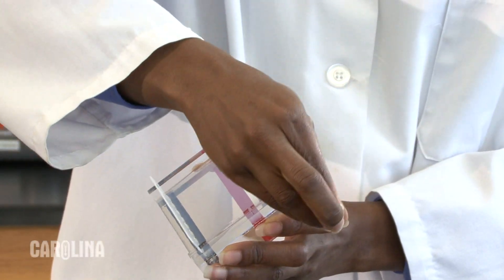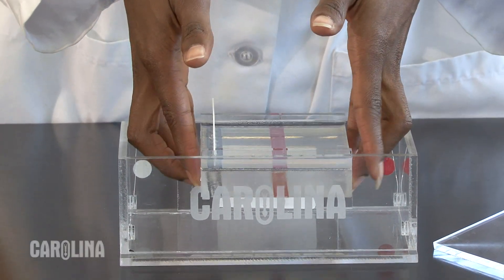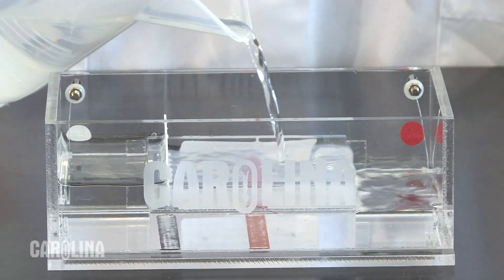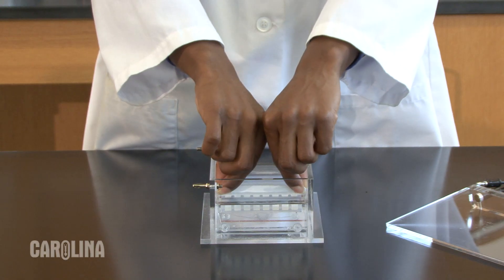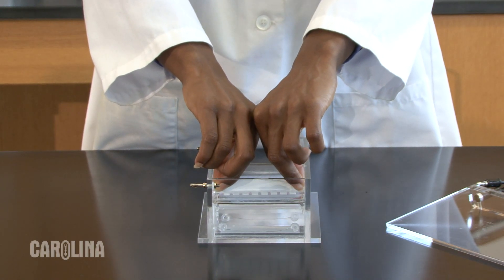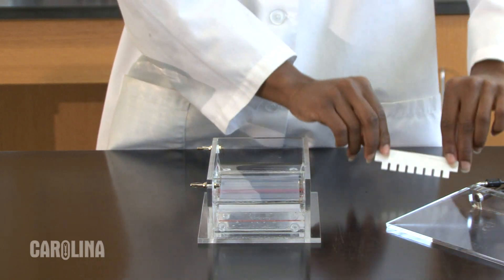Remove any masking tape or dams you may have used while pouring the gel, then place the gel into the chamber. Pouring buffer over the gel may make it easier to pull out the comb. The easiest way to remove the comb is to place your fingers and thumb on either side of the comb and gently pull up while simultaneously pushing down on the side of the gel tray. Now you are ready to load the samples.